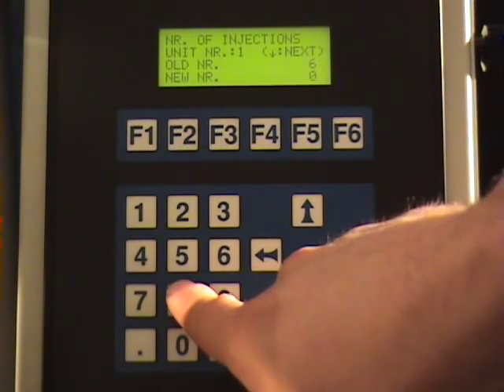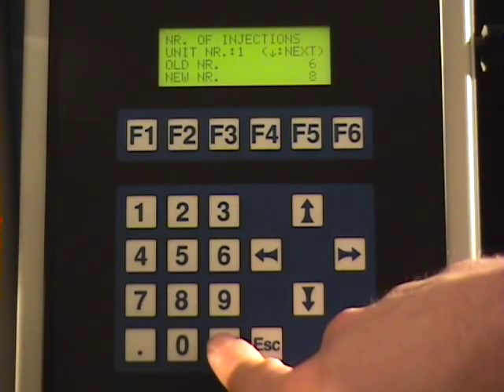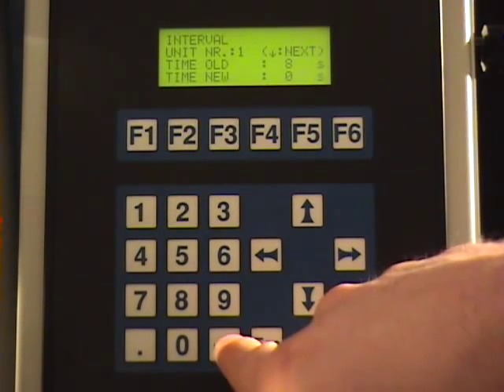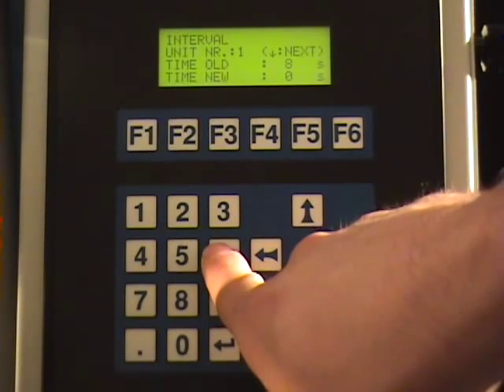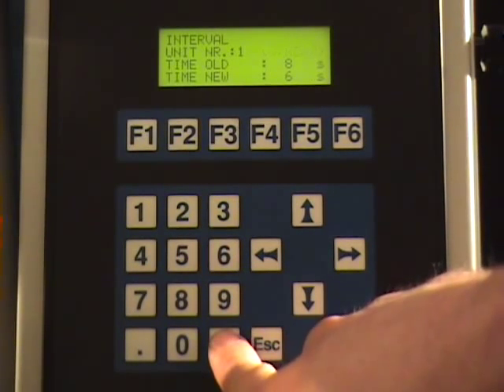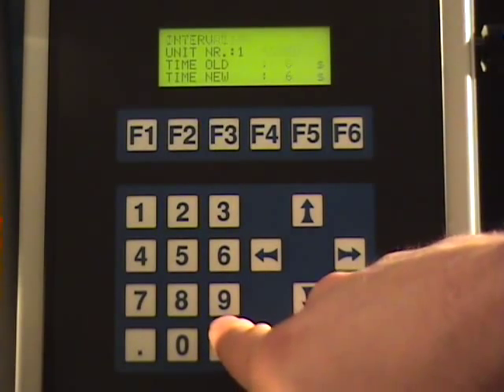Now you must specify the number of injections you wish to be performed. The last parameter of the cleaning menu is the interval between the solvent injections. This is to allow the pump sufficient time to drain the solvent from the tube.